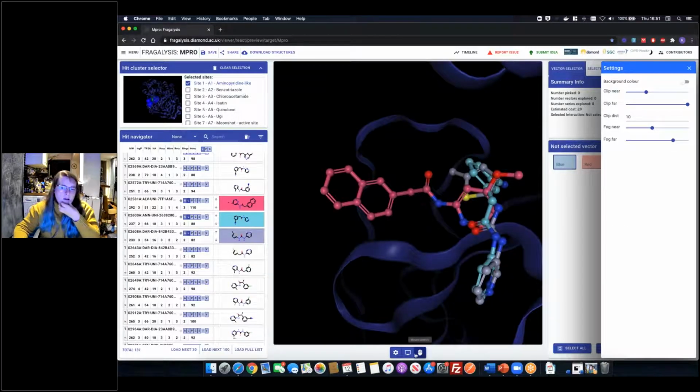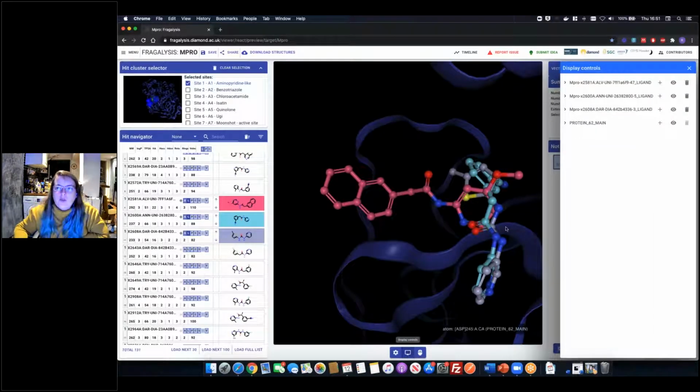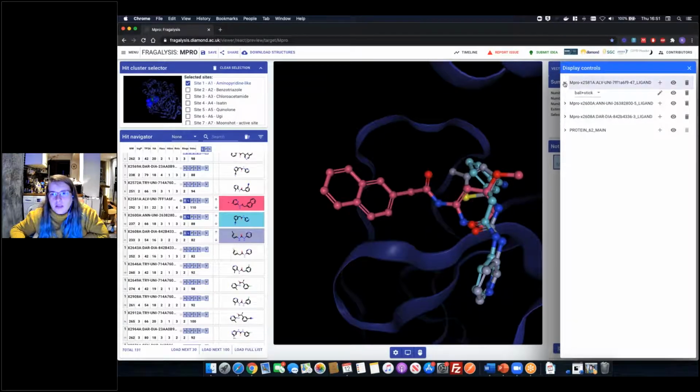Okay. So this central button underneath the 3D viewer is for display control. This is controlling exactly what's rendered in that 3D viewer and gives some control over the different ways to visualize things, similarly as you would in PyMol. For example, we're using the same labels in the name of the thing, and you're indicating whether you're using a ligand or a protein as well.